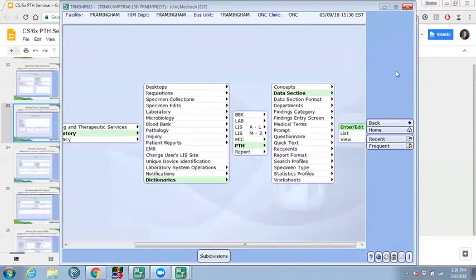If you guys have any questions on all the material covered until now, please let me know. I will be going over, yes, so there are 2 questions that are asked. The first one is, can you default in a label device in the enter edit screen? And if so, where is it set up?